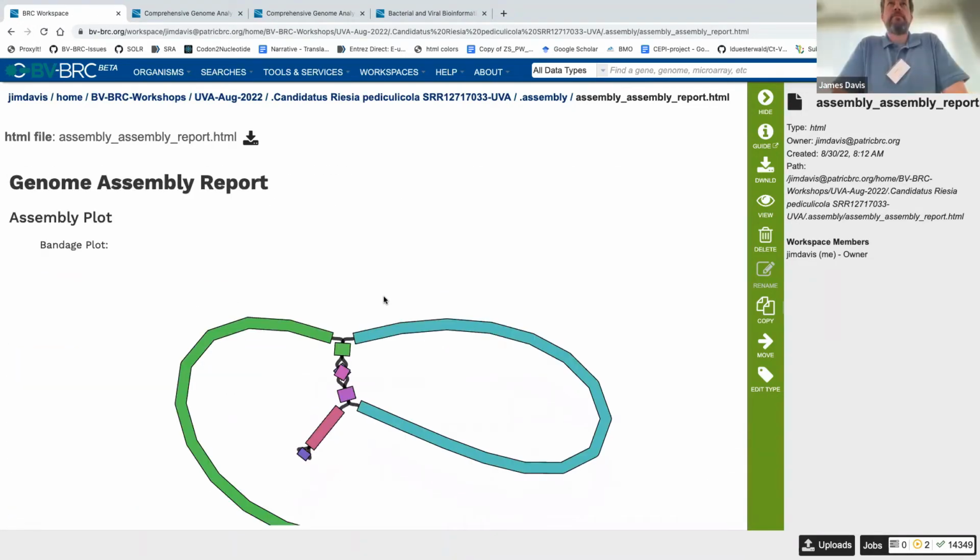Very often when I run assemblies in PATRIC or BV-BRC, at the bottom of my Bandage plot there are kind of little orphan chunks of sequence. And I wonder what those represent. They represent ones that can't be put together, I think. Okay, might be plasmids. Could be plasmids, yeah. That would be excellent. Yeah. If you look at the contents that came out, you'll probably see a bunch of plasmid content down here.